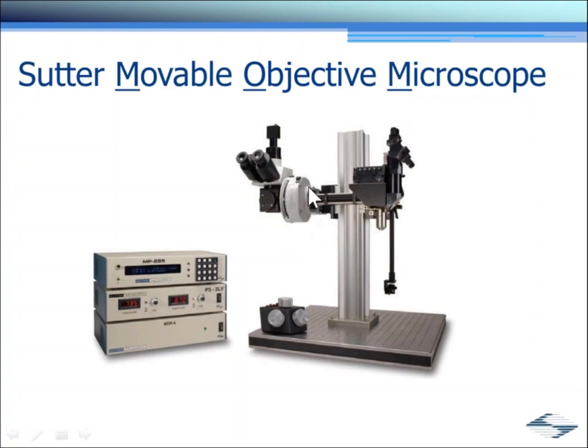This is actually the vertical illuminator of an Olympus microscope, mounted on its side. This allows for an interesting wide field path on the microscope. We can attach a camera, eyepieces, filter cubes, a fluorescent light source, for example, and do all kinds of standard wide field imaging, if you wished, on your two-photon microscope with the addition of these components.